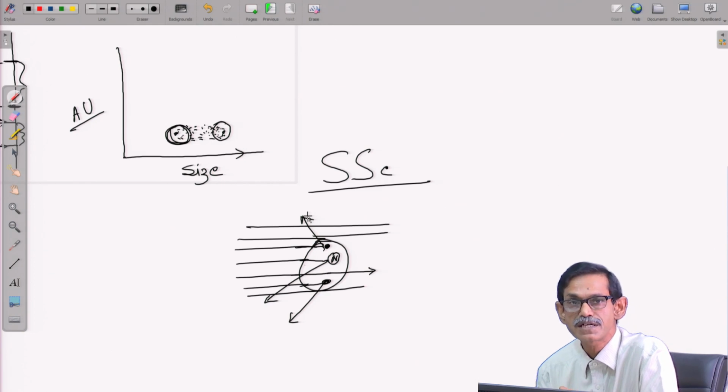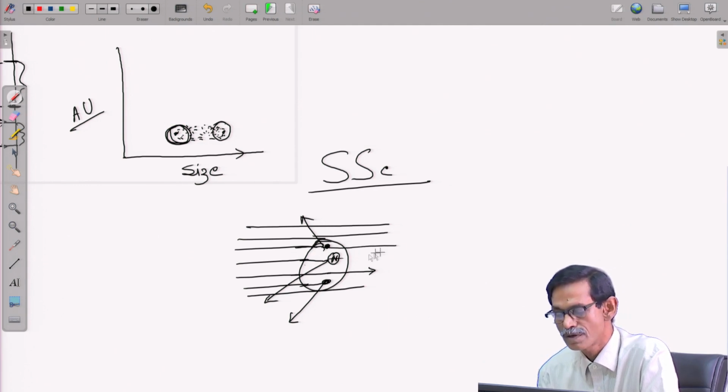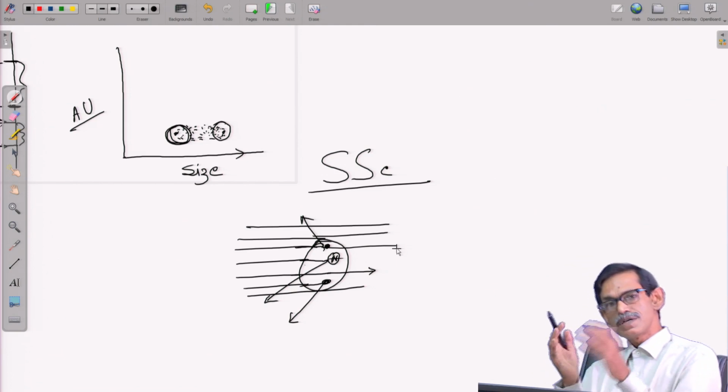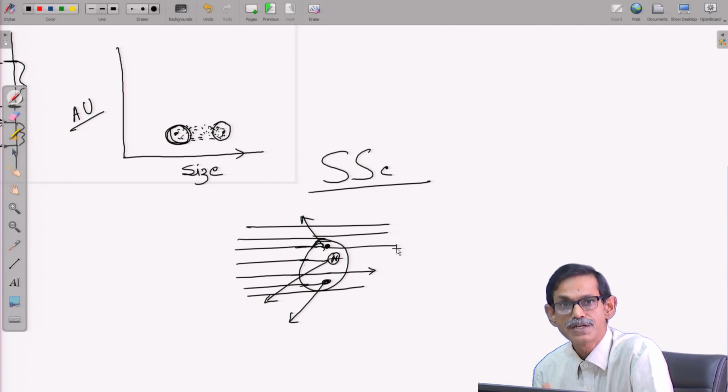So, which cell will scatter sidewise most? If they have more particles inside. If the cell does not have more particles, most of the light will go. Okay. So, if you remember the blood, what is there? There are neutrophils.